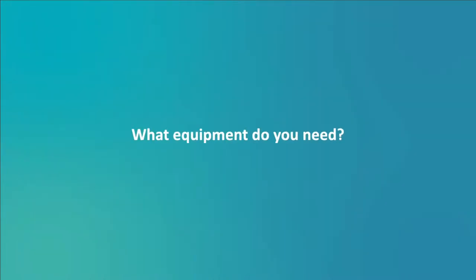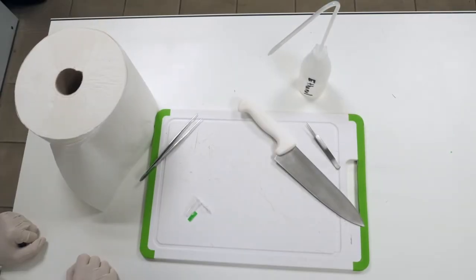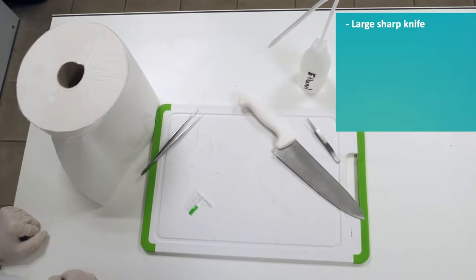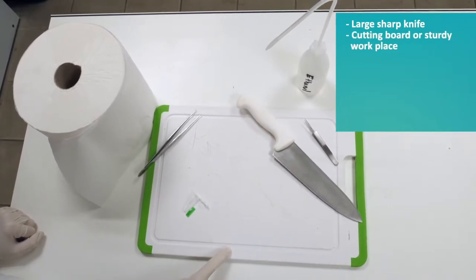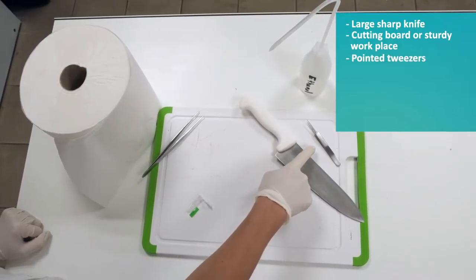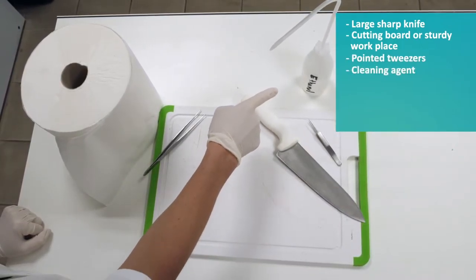What equipment do you need? To extract the otoliths from a fish, you will need a large sharp knife, a cutting board or a sturdy work surface, a pair of pointed tweezers, cleaning agent, and ethanol.